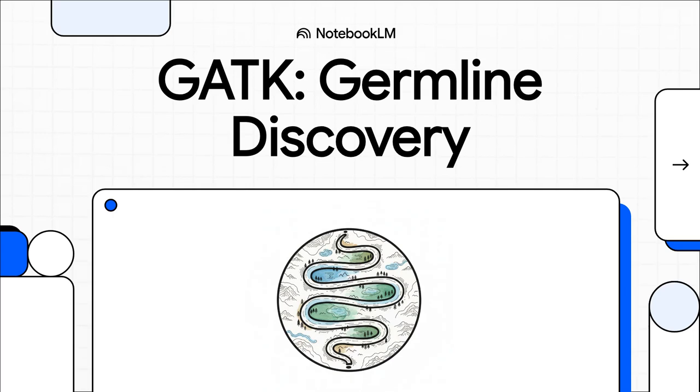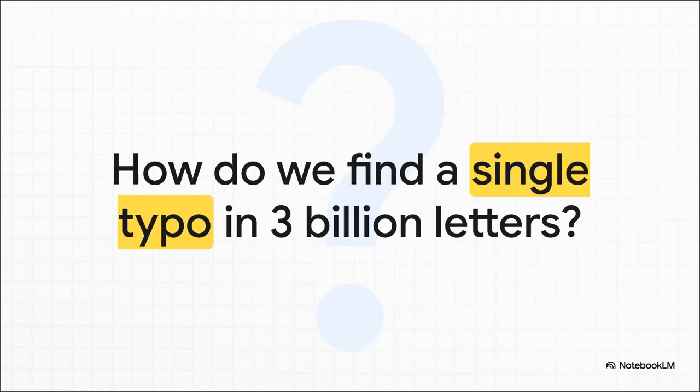Okay, so when we're doing genomics, the sequencers just flood us with this ocean of raw data. It's chaotic. So how do we possibly go from all that noise to finding one single, meaningful genetic variant? Well, today we're going to walk through the absolute gold standard for doing exactly that, the GATK best practices for germline discovery.